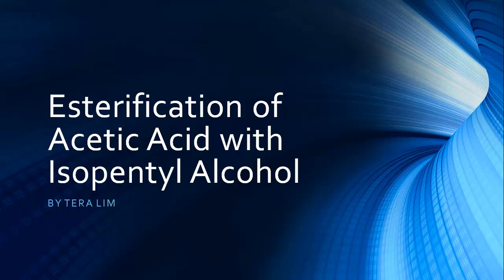We're going to go over the esterification of acetic acid with isopentyl alcohol. This presentation looks in detail at the mechanism for the formation of esters from carboxylic acids and alcohols in the presence of concentrated sulfuric acid, which acts as the catalyst for the reaction. It uses the formation of isopentyl acetate from acetic acid and isopentyl alcohol as an example.